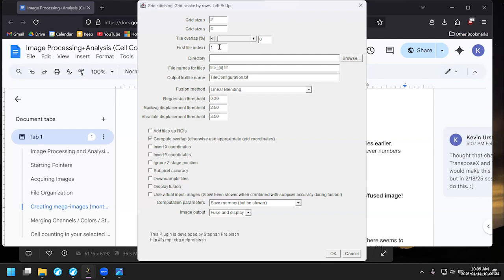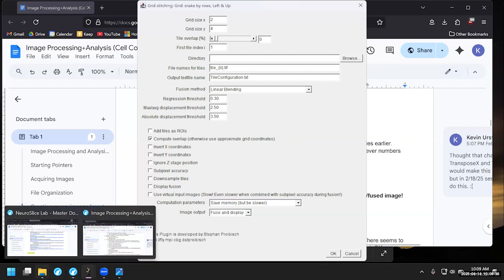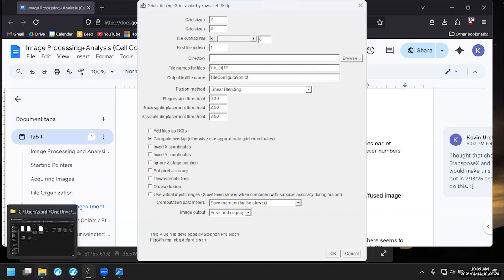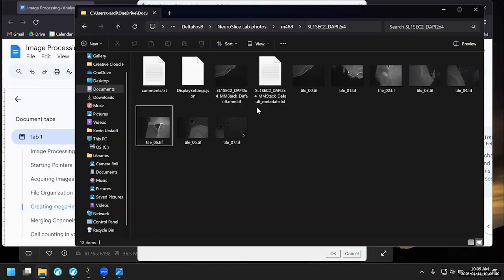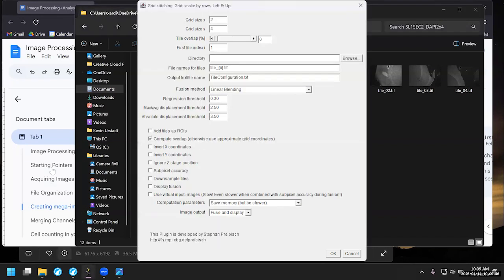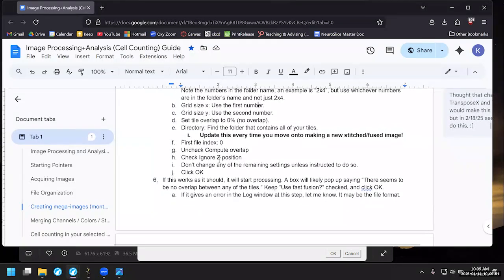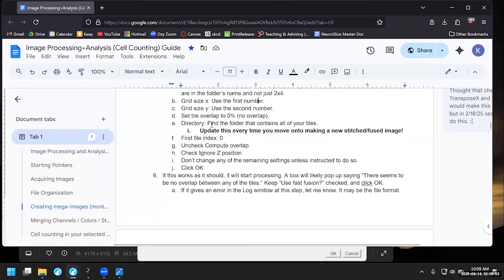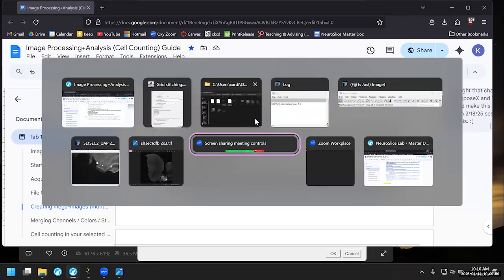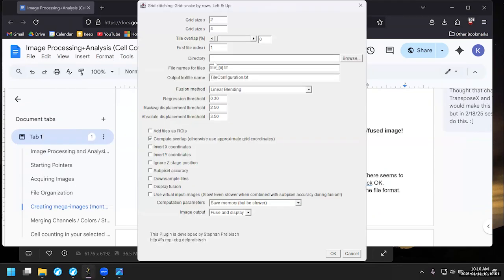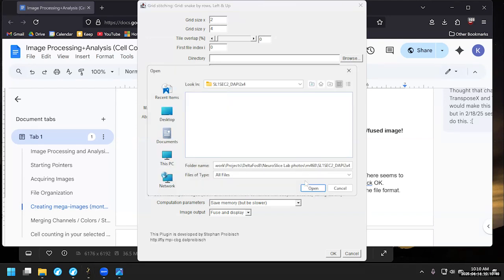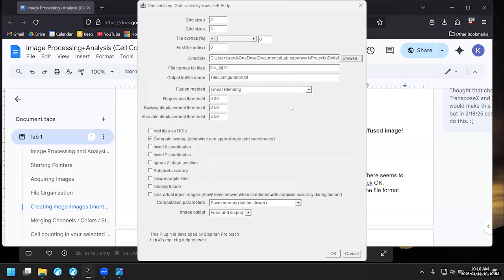First file index, we will want to double check this. It's probably going to be zero. Yeah, so file starts at tile underscore zero zero. So let's go ahead and just check this out. Make sure the instructions are as they should be here. Tile overlap zero percent. Find the folder that contains all your files. First file index zero. So I'm getting a little ahead of myself here. Let's go back to here. Zero. Every time you create a new mega image stitched file, you must do this. You have to find the directory that it's in. We'll click open once we've found the directory where we want it to go. You'll notice file names for tiles. We already configured this. The stuff in the brackets is just what gets replaced with numbers. Output text file name, we can leave this as default.